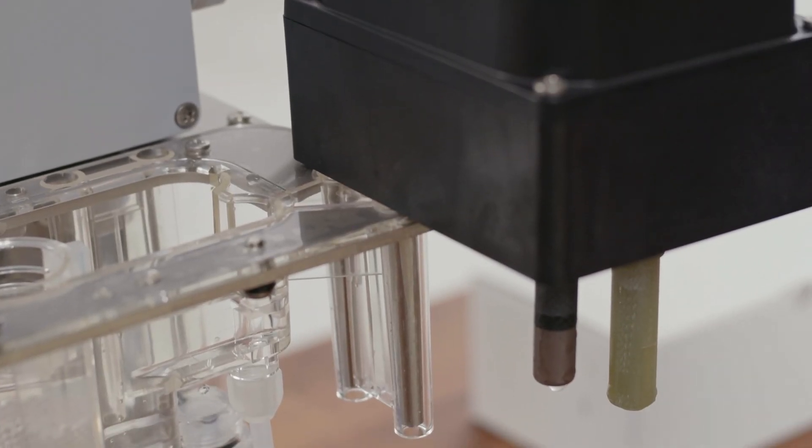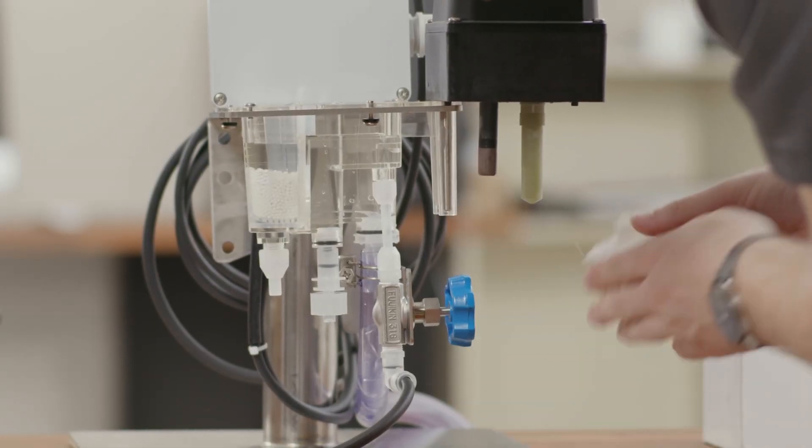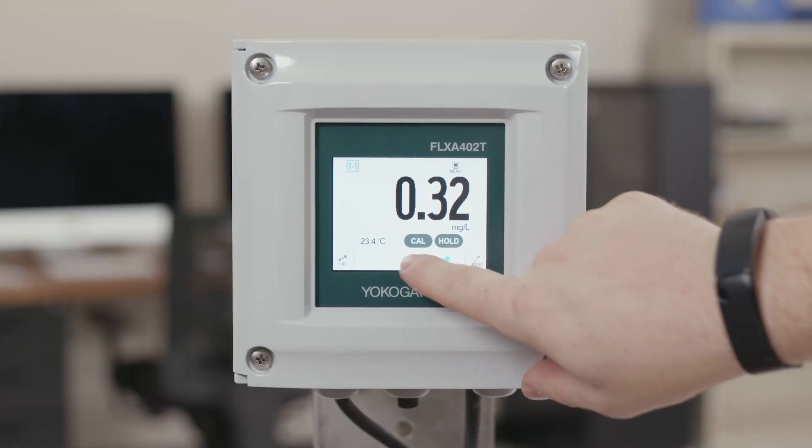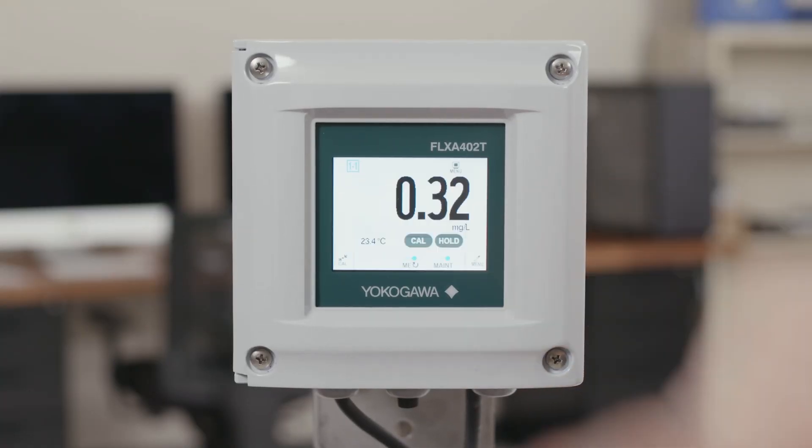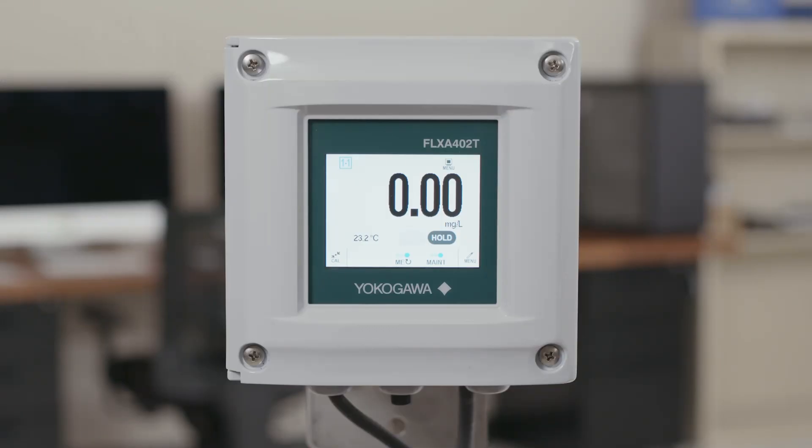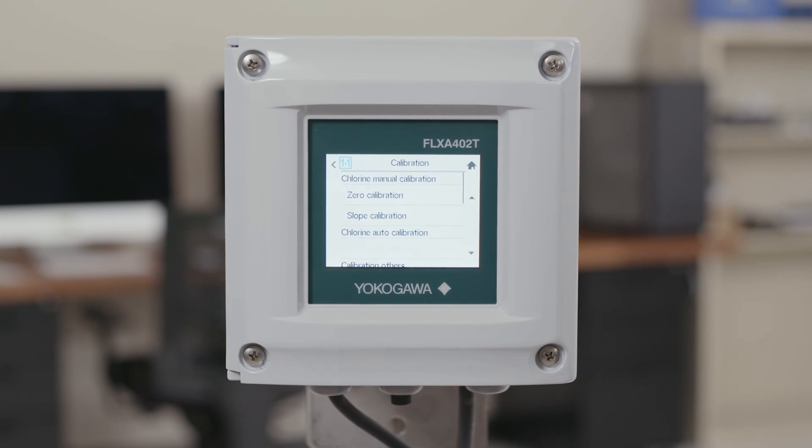Once you have put the measurement assembly into maintenance position, you can go ahead and dry off the measurement electrode so that there's no excess process on it and make sure that the motor is turning and the measurement electrode is spinning. Once it is spinning, you can go ahead and click the calibration button on the home screen which will take you to the calibration menu.